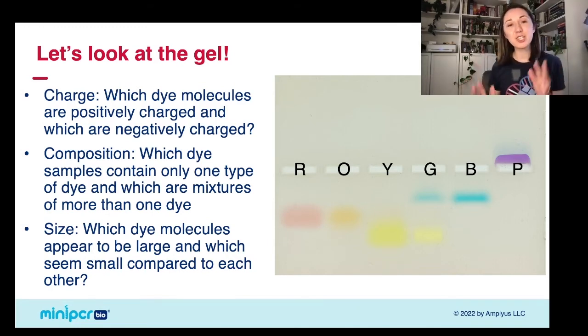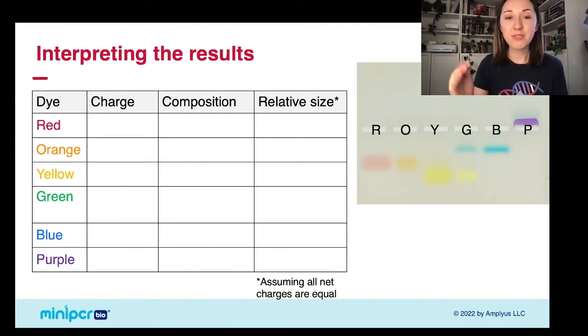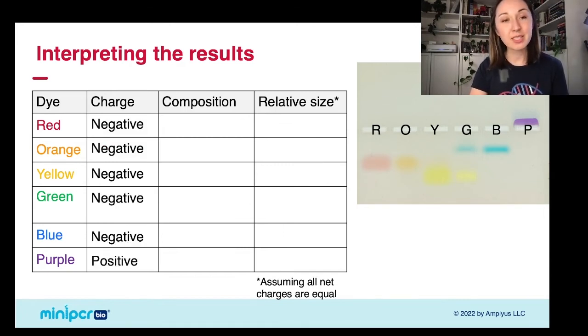So first, we're going to look at the charge of each of our molecules. Again, the first five moved down. They moved towards our positive electrode. So that makes them negatively charged. And our purple band moved up towards the negative electrode, so that makes it positively charged.